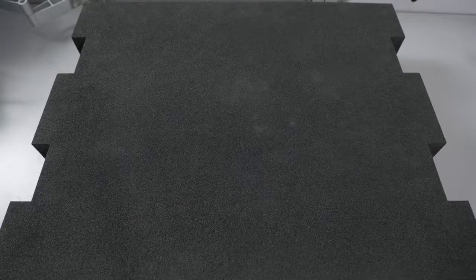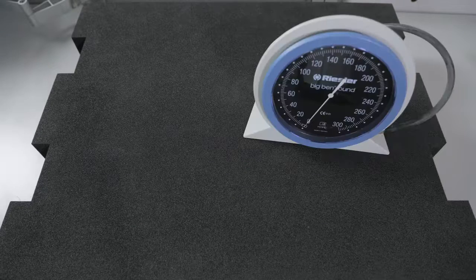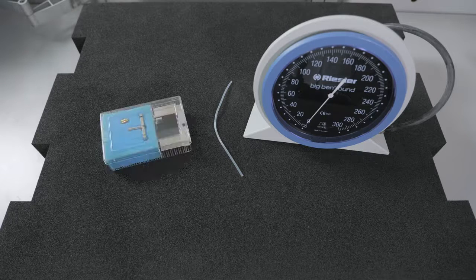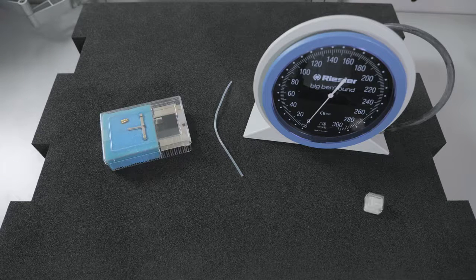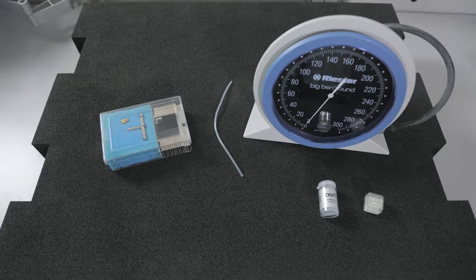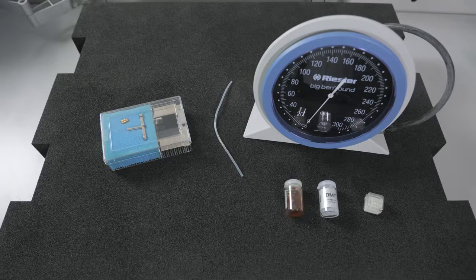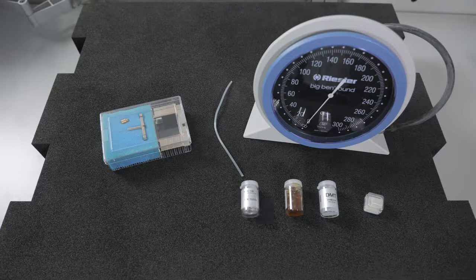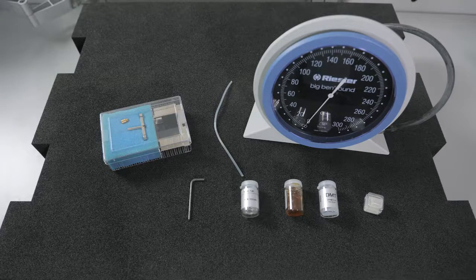For maintaining your system, you will be given a big bend manometer, a calibration shunt, a force calibration kit, a pack of replacement cover glass, clear grease for maintaining the security around the force transducer, brown grease for maintaining the micropositioners, extra screws, and an Allen key for making adjustments.